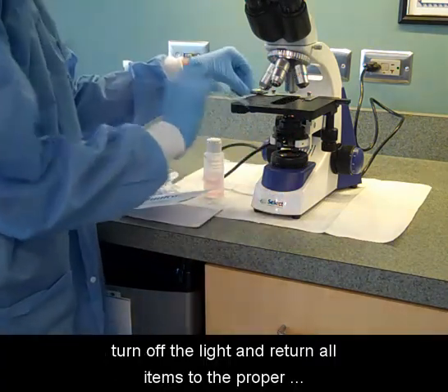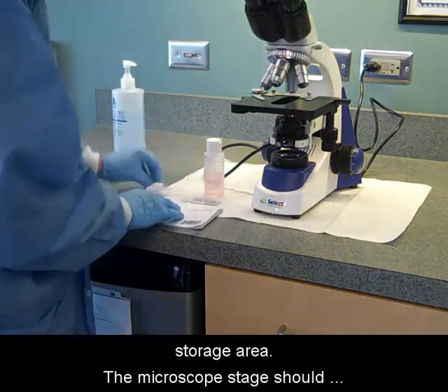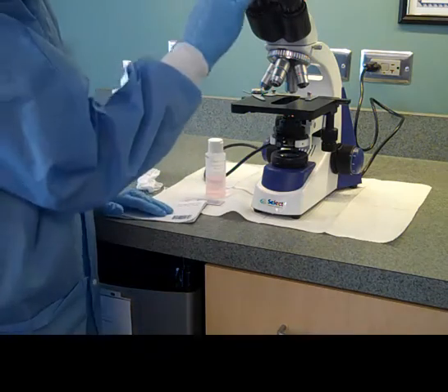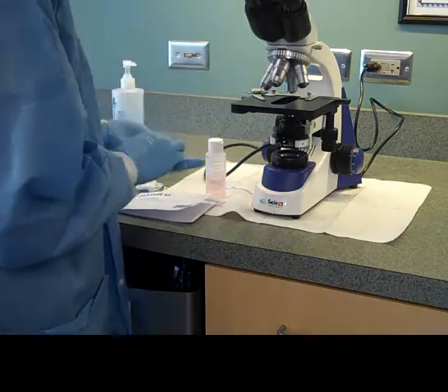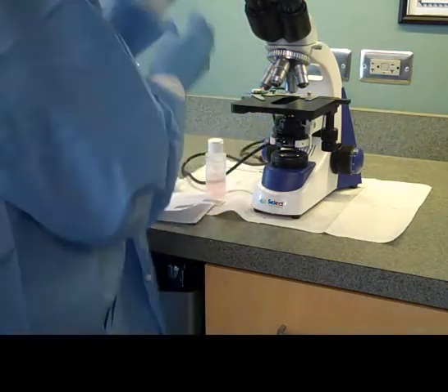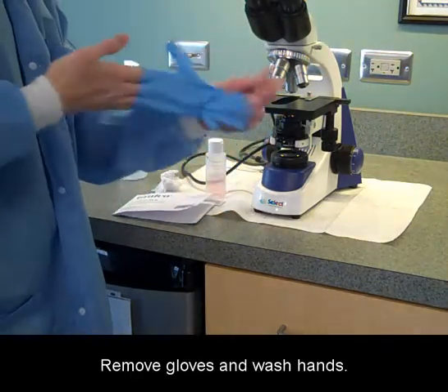The microscope stage should be cleaned and recorded in the maintenance log. Remove gloves and wash hands.